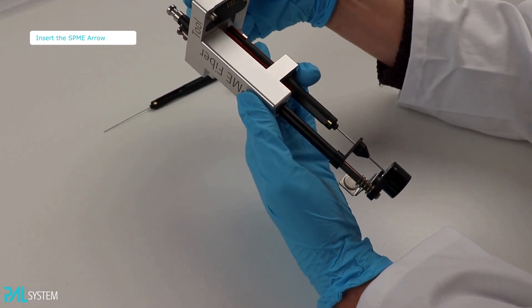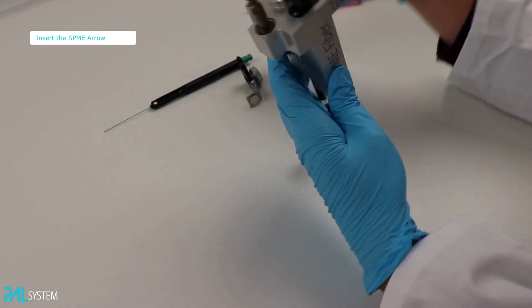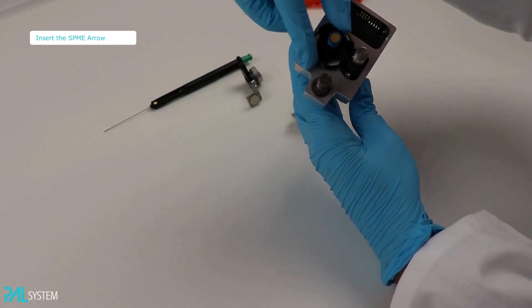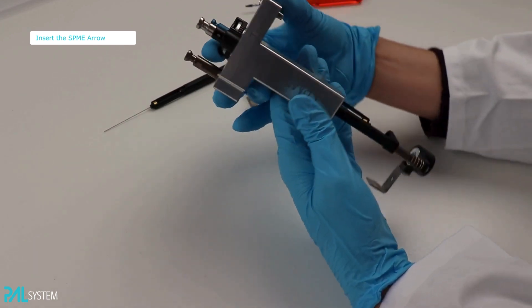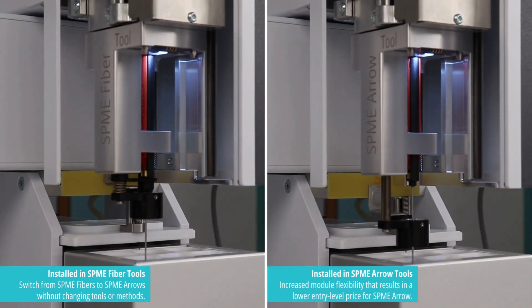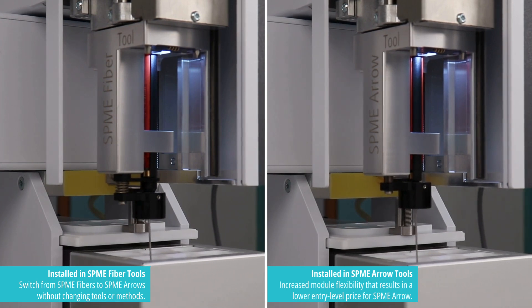Congratulations, your SPME Fiber Dual can now be used with SPME Arrows. Please note that you will need to adjust the GC inlet as well as review method parameters such as injection penetration depth, desorption time, and maximum SPME penetration.